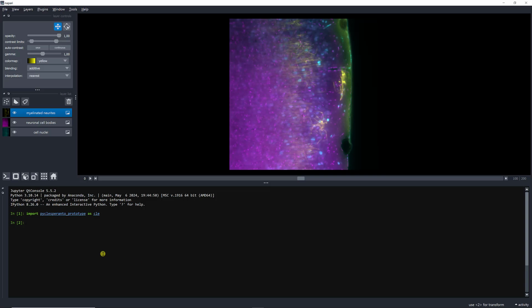which is there because I installed the Napari assistant, then I can tell it which device to use. In my case, it's 0. When I do that, it tells me that it's really my big GPU, the RTX 3080, that is going to be used. So if you see that when you're running, it takes a lot of time, and when you look at your resources, it's using your small GPU. If you have two, you can change it that way.